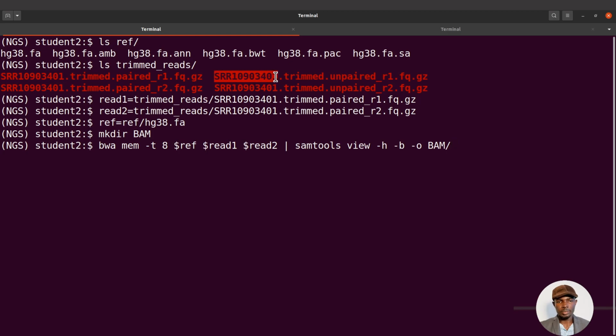and then I'll bring the sample name. I'll copy and paste, and I'll say .bam. You can also say .raw.bam. That's also fine. It depends on how much processing you are going to do on the BAM file. For this tutorial, we are just using a single BAM file, so that's why I'm just giving it .bam. But if I was going to do further processes to generate other BAM files, then I'll add some sort of description, like .raw.bam, or maybe .sorted.bam. Just something to describe the BAM file that I would generate. But for this tutorial, I'll just use .bam.